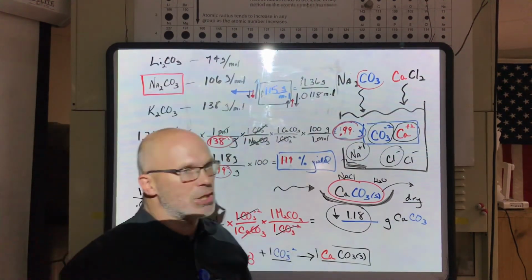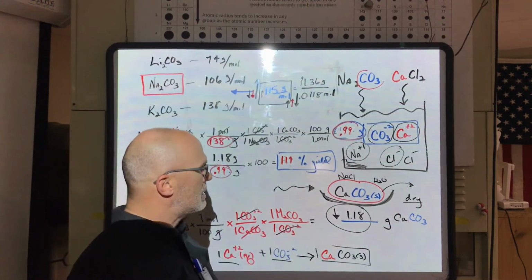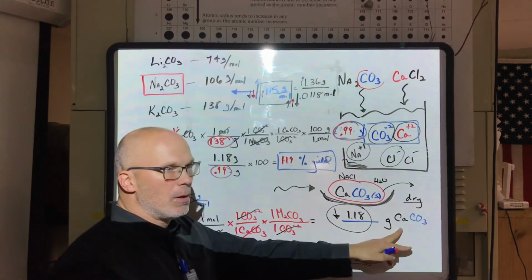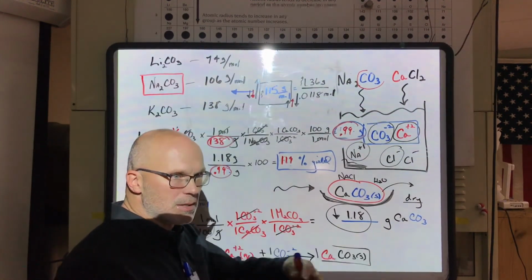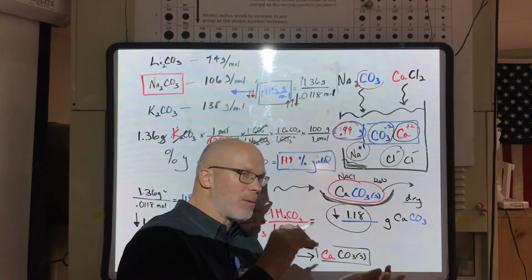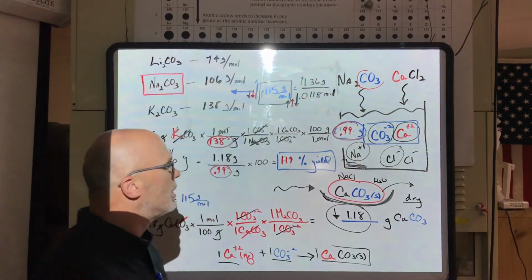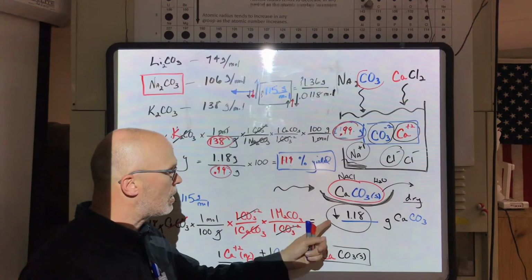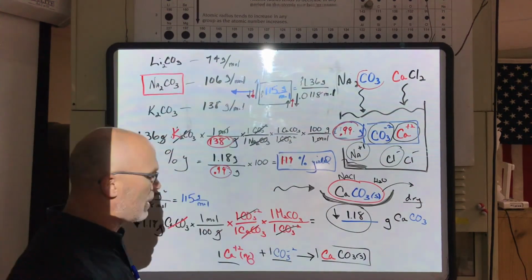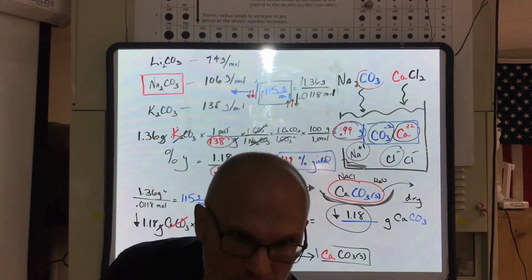So a lot of competition of errors here, but the major player for me is the fact that you couldn't get all the precipitate. And since it's 100 grams per mole, anything missing, you really missed a lot of weight there. Water is 18 grams per mole, so if you had some extra water on there, obviously if it's wet, it's going to be a huge addition of mass and a huge over-evaluation of your grams and thus moles. So something to think about. Hope that helped, but certainly a good discussion of errors here.